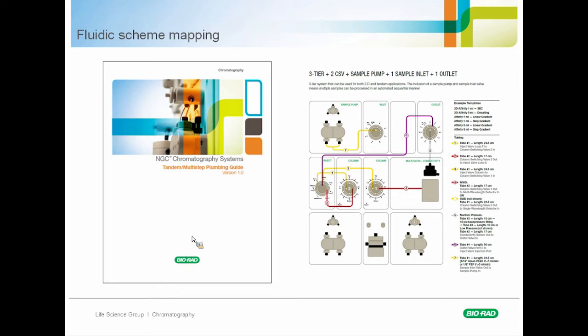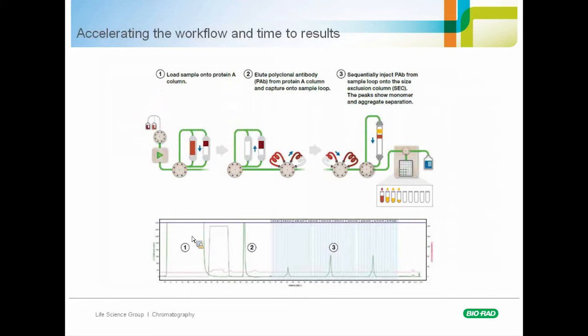After the ion exchange column, you could then collect the fractions, and you'd then run the antibody over your size exclusion column to remove any aggregates or to remove any heavy light chain fragments. Now, this process was a 2 to 3 day process when I did this routinely, with the dialysis, with the gels, etc. included in here. So quite a lengthy, laborious procedure.